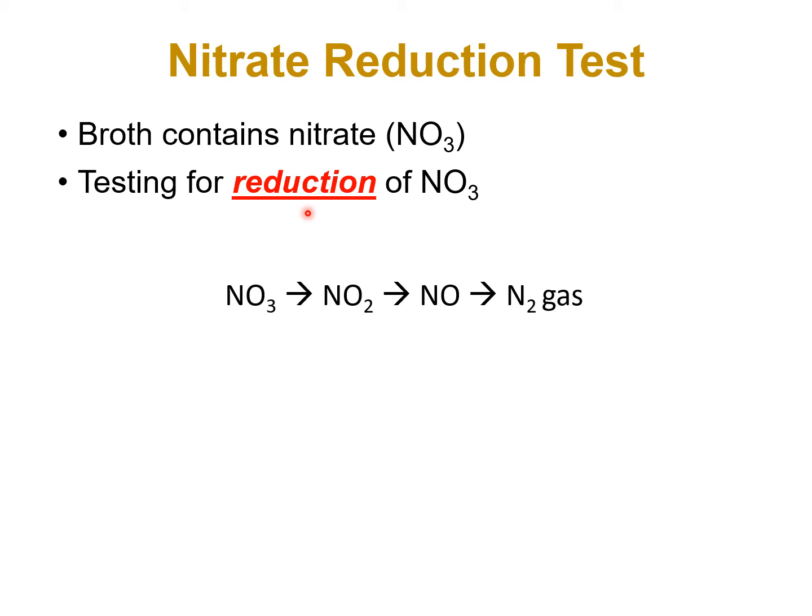One more time, they're capable of using nitrate as their final electron acceptor.